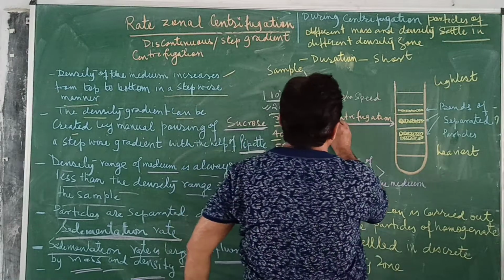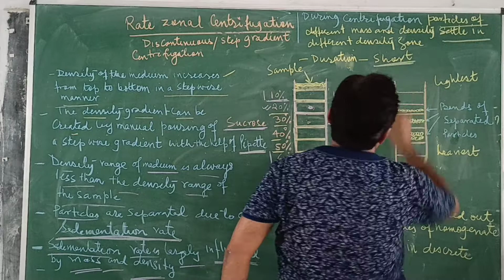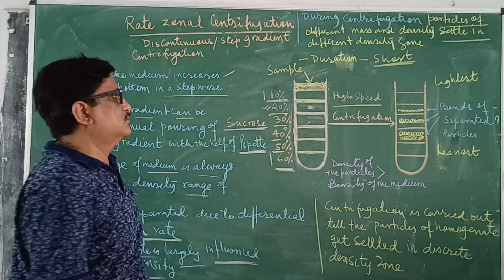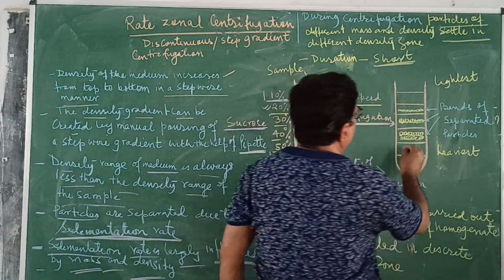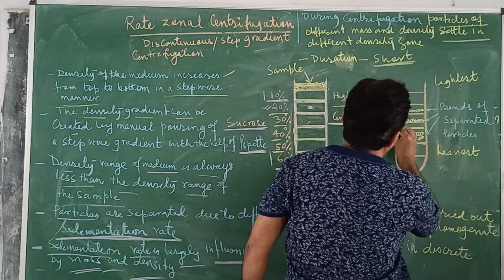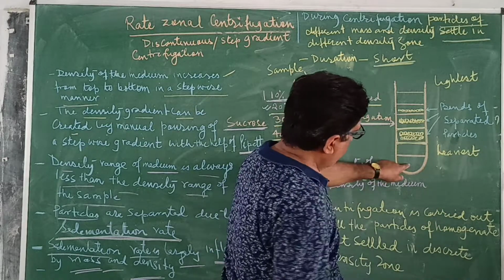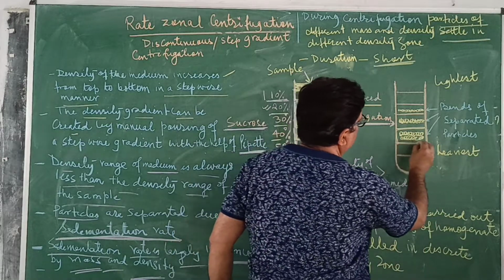When we centrifuge at high speed for a short period, which is important, the heavier molecule will move towards the bottom and settle over here.